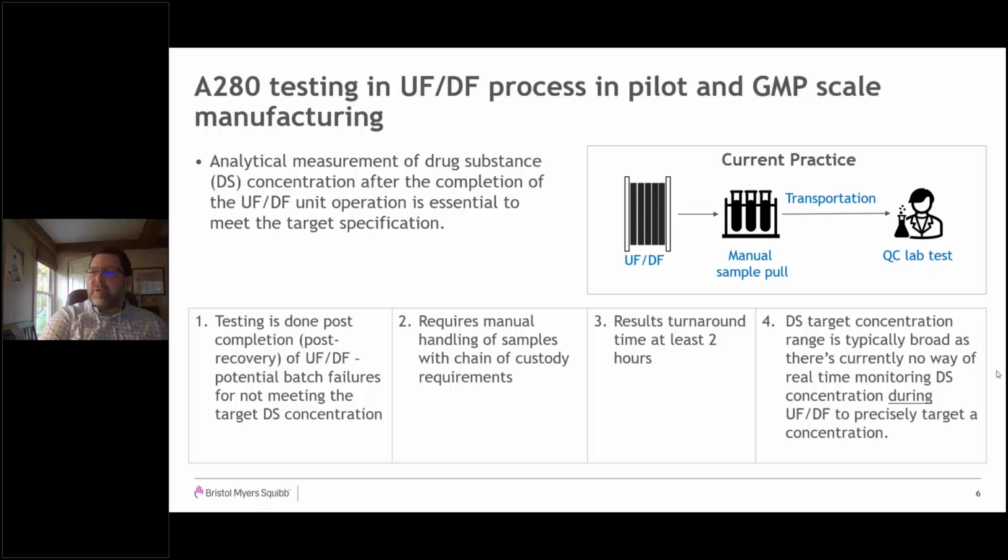So right now, one of the problems is that we are manufacturing high concentration protein in the clinic without using a FlowVPX meter and without testing on the floor. I'm not going to talk about at-line testing with the Solo VPE, but suffice it to say that it is part of the overall strategy we're looking at at BMS, incorporating process analytical technology to accelerate and streamline the UFDF process. I'll talk more about the benefits in the next few slides.